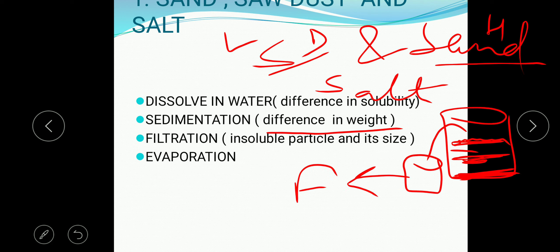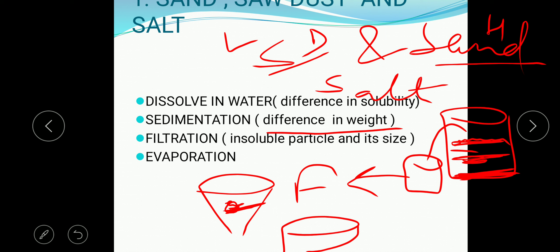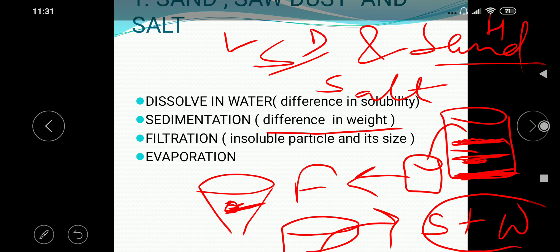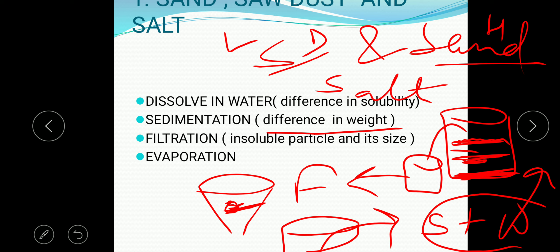After sedimentation, sand is separated by decantation. The decanted liquid is then applied for filtration. The residue remaining on the filter paper is the sawdust, and in the beaker, the solution of salt and water is obtained. This mixture is then left for evaporation.